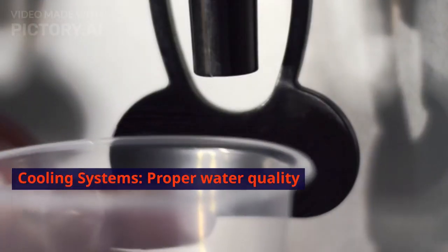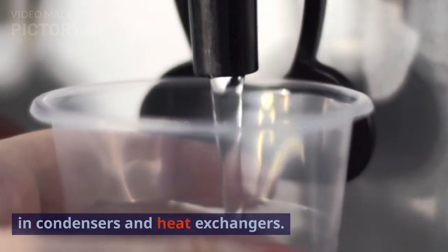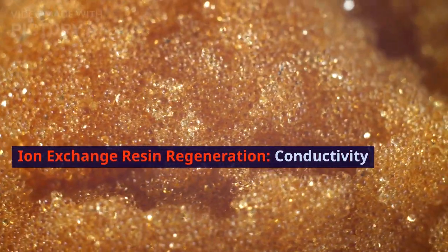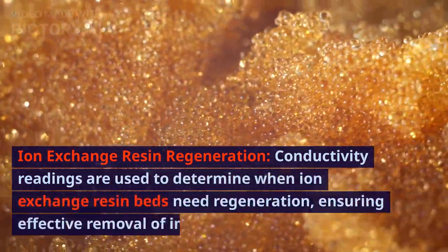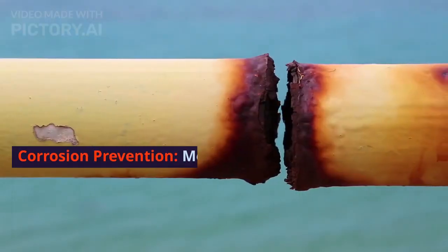Cooling systems. Proper water quality in cooling systems is vital to prevent corrosion and fouling in condensers and heat exchangers. Conductivity measurements help maintain efficient cooling. Ion exchange resin regeneration. Conductivity readings are used to determine when ion exchange resin beds need regeneration, ensuring effective removal of impurities from water. Corrosion prevention.